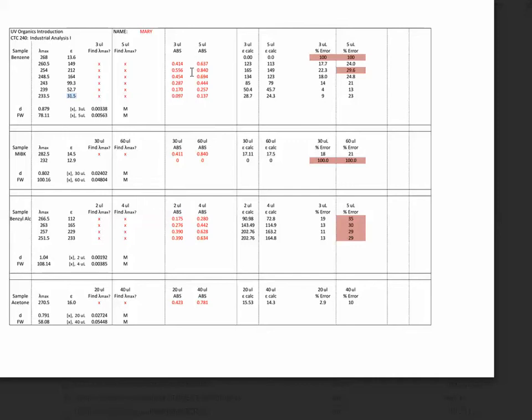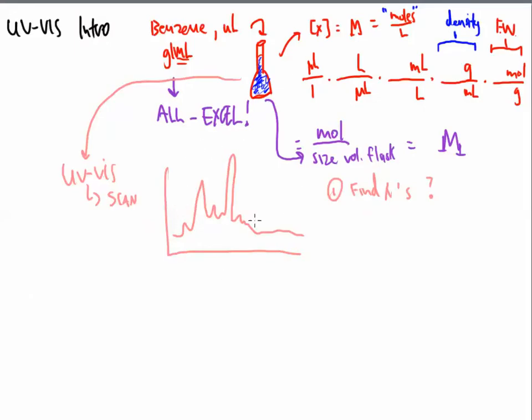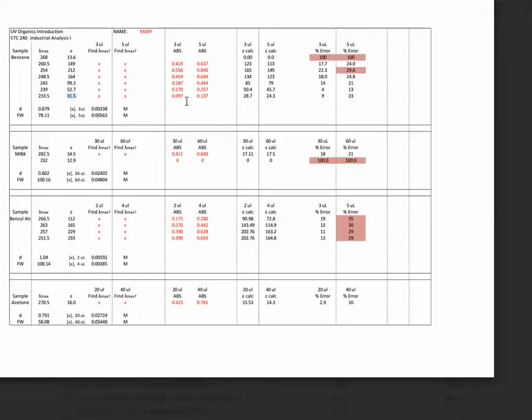In the next column over, these are straight from the UV-Vis tickets. What happened is that once I scanned this sample and tried to find the lambdas on the UV-Vis ticket itself, it's going to give me absorbance values. It will probably say maximum and minimum. I'm looking for the maximum here. So the absorbances that are at the maximum, which means at the peak up here at the very top, that is what we're after. These absorbance values come straight from the ticket. I don't do any calculations with those at all. This is the absorbance values for the three microliter sample, and these are the absorbance values for the five microliter sample. Again, I leave the first one empty because I didn't find the 268, so I don't have absorbance values for the 268 lambda.